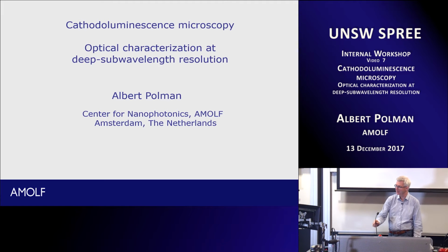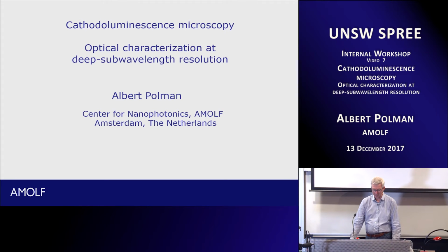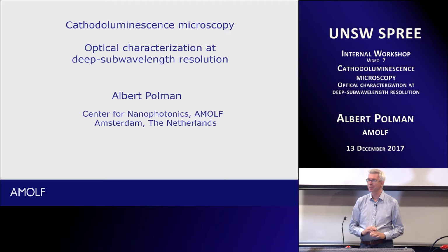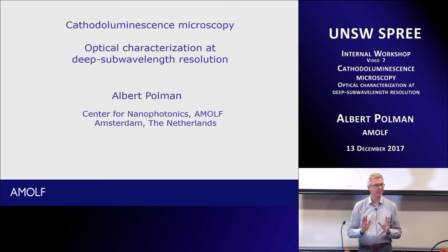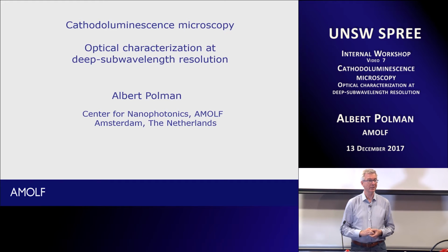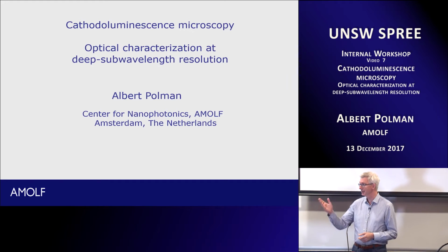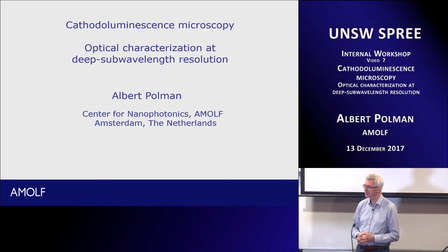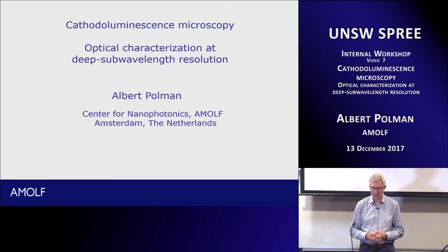Thanks, Steve, for your introduction. So, I'd like to talk about cathodoluminescence microscopy, and I just assume that nobody knows about this, okay? I'm going to really start from the basics. It's a measurement technique for doing optical measurements that uses electron microscopy. And I think it can have some really interesting applications in photovoltaics, as was said. There may be things you can do with cathodoluminescence that have not been done before.